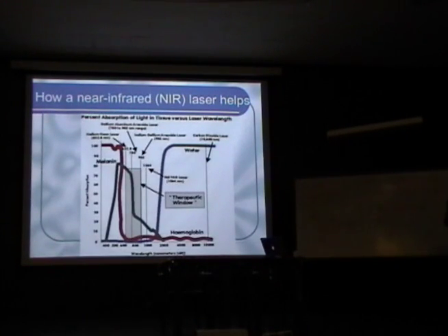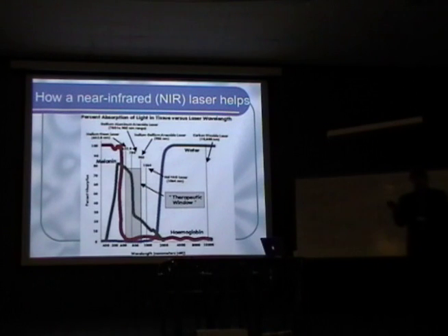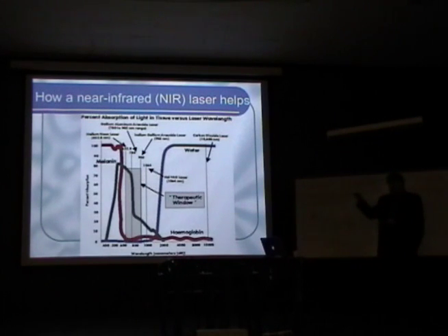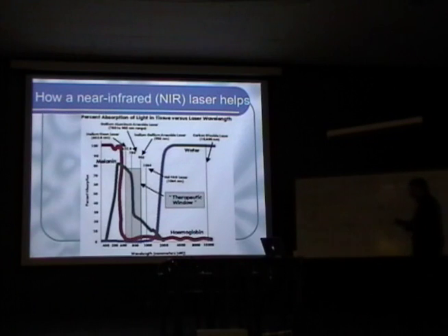The other advantage of using the multi-photon excitation processes is that, as I already mentioned, one can do excitation in the near-infrared part of the optical spectrum. And this is especially beneficial for the imaging of biological tissue, because in the near-infrared, somewhere between 700 and 1100 nanometers, there is the so-called biological transparency window, where biological tissue does not absorb much and also does not scatter light that much. And so by using this property, one can achieve very deep penetration of the imaging light into the biological tissue.